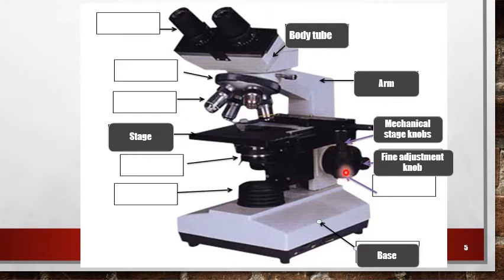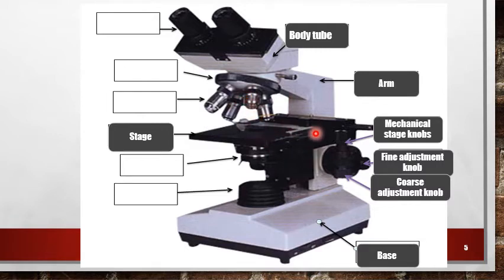Focus adjustment knobs: there are two knobs, fine adjustment knob and coarse adjustment knob. They are used to change the distance between the object or slide on one side and objective on the other side, for the purpose of clearing the image.